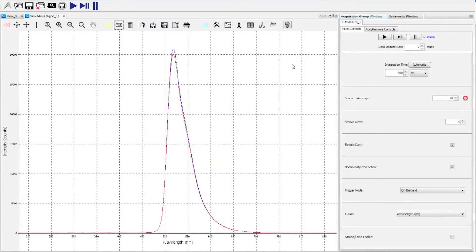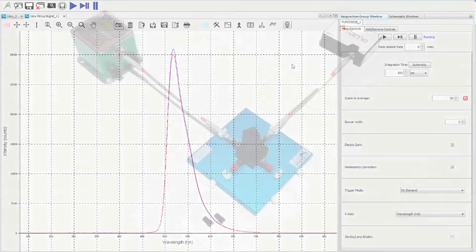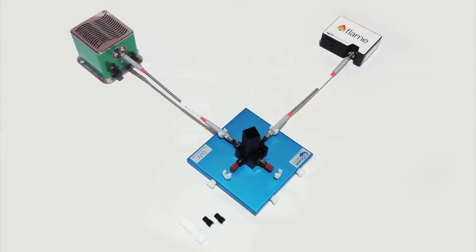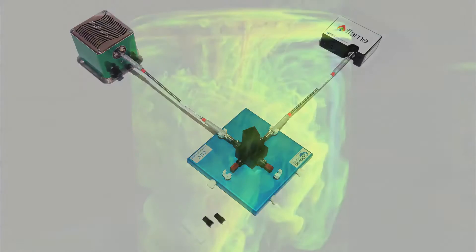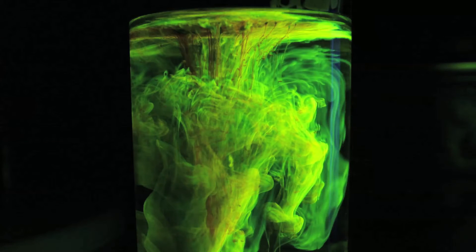In this video I'll demonstrate how to perform fluorescence measurements using Ocean Optics equipment and software. We will talk about the required equipment and setup and how to optimize your measurements for best results. In this video we will use fluorescein as our fluorescent sample.